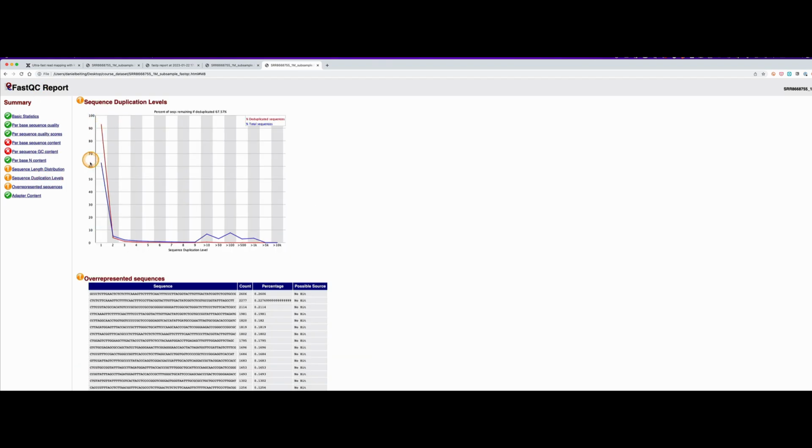I just want to point out that FastQC tries, but oftentimes fails to report or interpret these statistics and plots. You can see that here on the left-hand side. So it's flagged many of these as being good or passing some metric, while others have a yellow warning with an exclamation, and still others have this concerning red X for failing. FastQC knows nothing of the kind of experiment we ran. It doesn't know if we did RNA-seq or ChIP-seq or genome sequencing. And it makes some fundamental assumptions about the kind of data that we're working with that can just frankly be wrong. So if we click on sequence duplication levels, it's a good example of what I'm talking about.